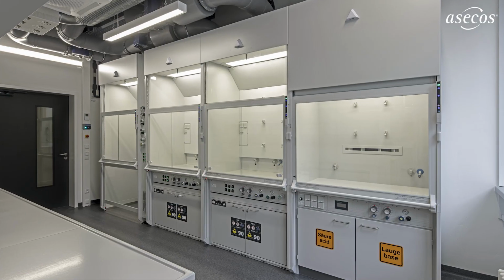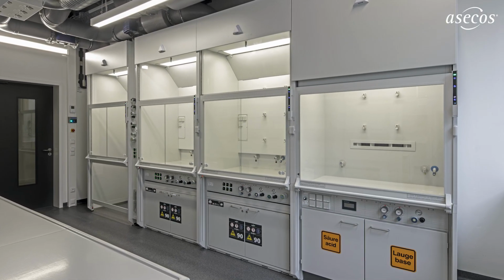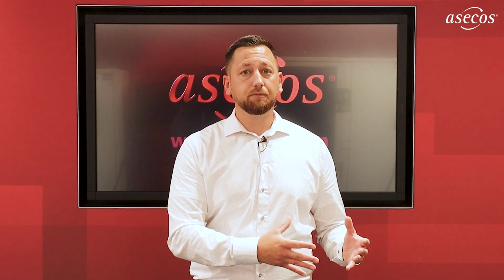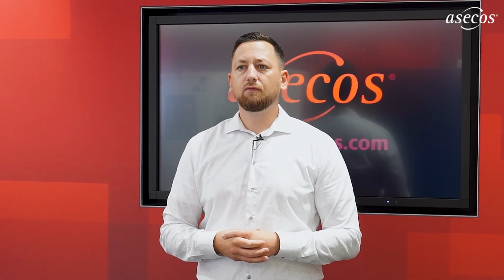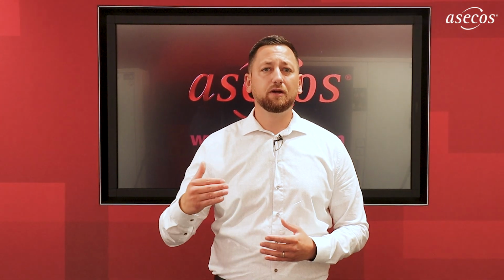3. There are other certified solutions such as fume cupboards in accordance with BS EN 14175 and laminar flow tables. These solutions are often cost-intensive, oversized for many industrial applications, and also require a comparatively above-average ceiling height for installation.